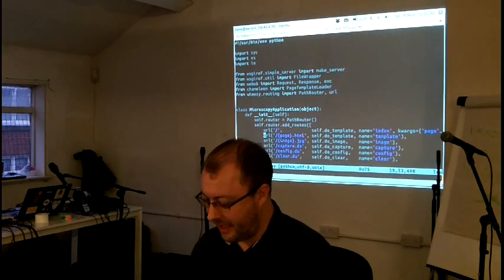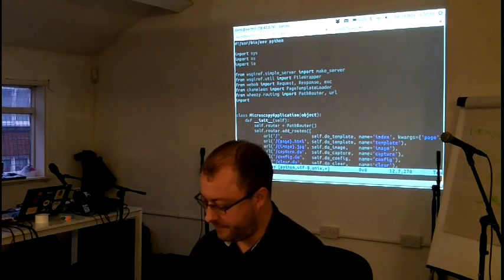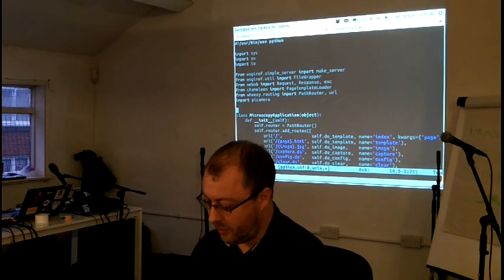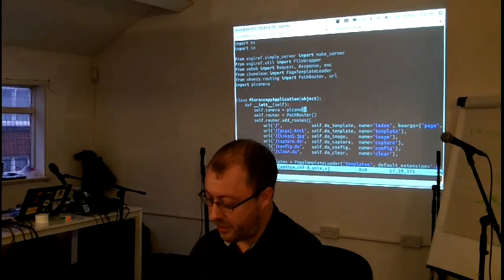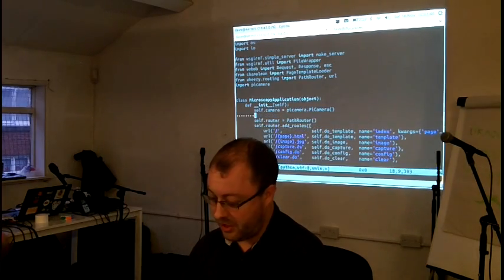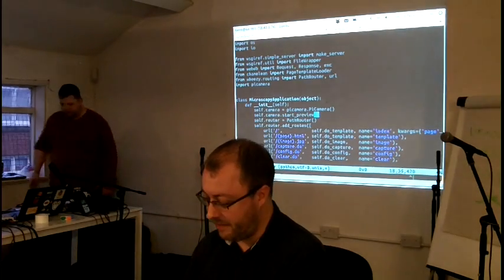So how do we add the camera to that? Well, this is where the PiCamera library came in that we did this morning. So we import picamera. We're going to do self.camera equals picamera.PiCamera to initialize it. We would start a preview so that we can see something on the screen.